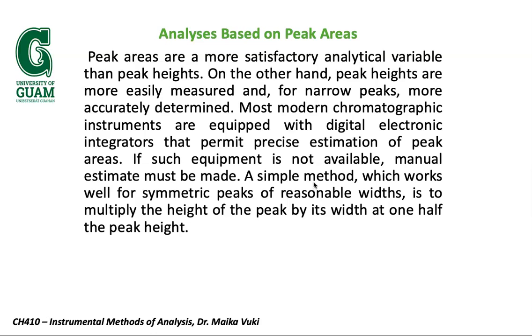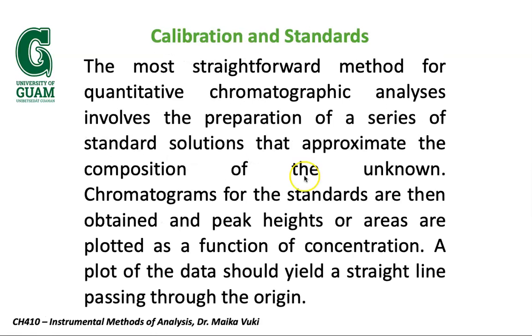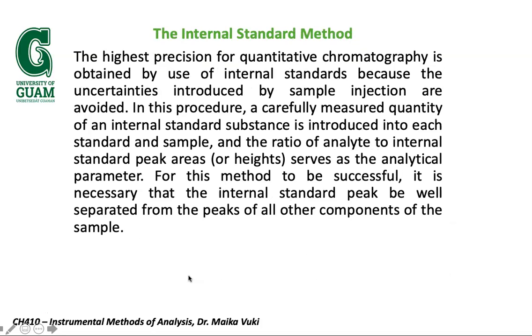In the analysis, usually you have to prepare a set of standards, run through the standards, and then prepare a calibration plot using the standards. Now, one very common application is the use of an internal standard.